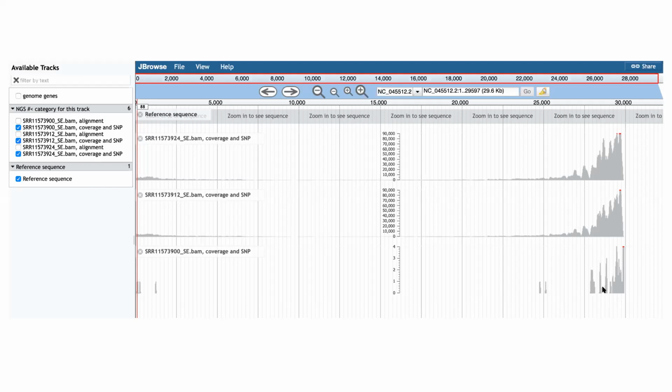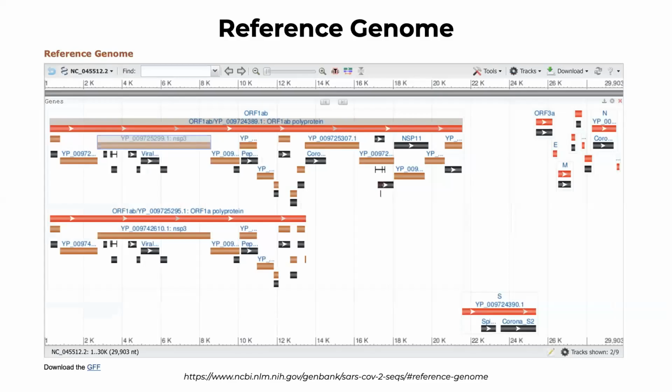And so the data preparation technique, which looks for poly-A mRNA sequencing, is going to give you these kinds of skewed results, but you are still able to detect the presence of the COVID-19 genome in the two samples that were infected with COVID-19. And in this sample that was not infected with COVID-19, it was mock infected, we do not see the genome at all. We can also annotate the genome, right?